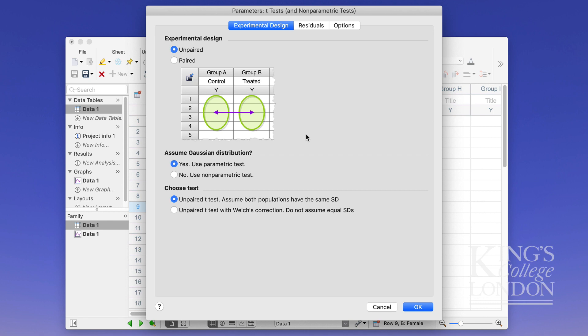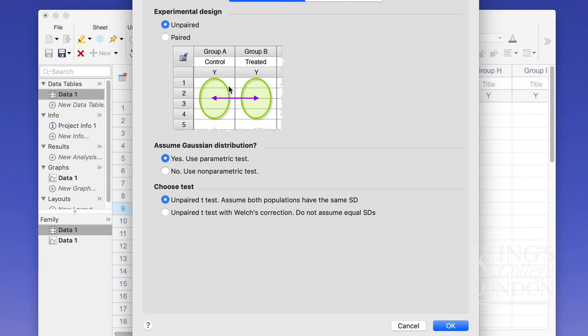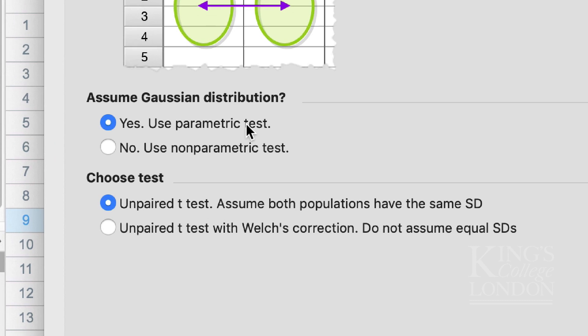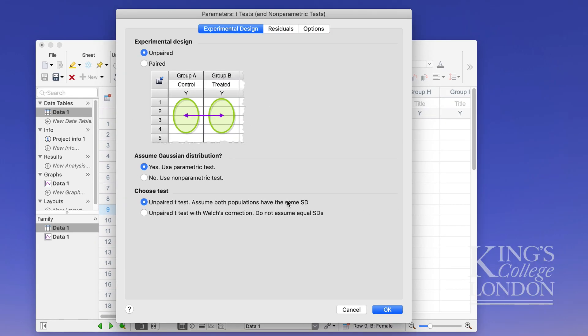So I'm going to choose unpaired and I'm going to use a parametric test. Of course I've not tested whether my data are normally distributed and I suspect under this example they won't be but I am going to do a parametric test anyway and of course my test is an unpaired t-test where I assume that both populations have a similar or the same standard deviation.